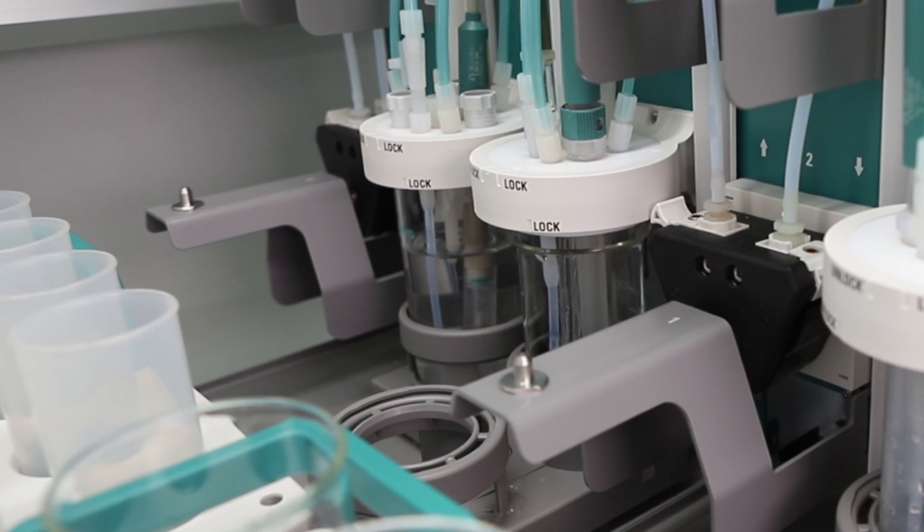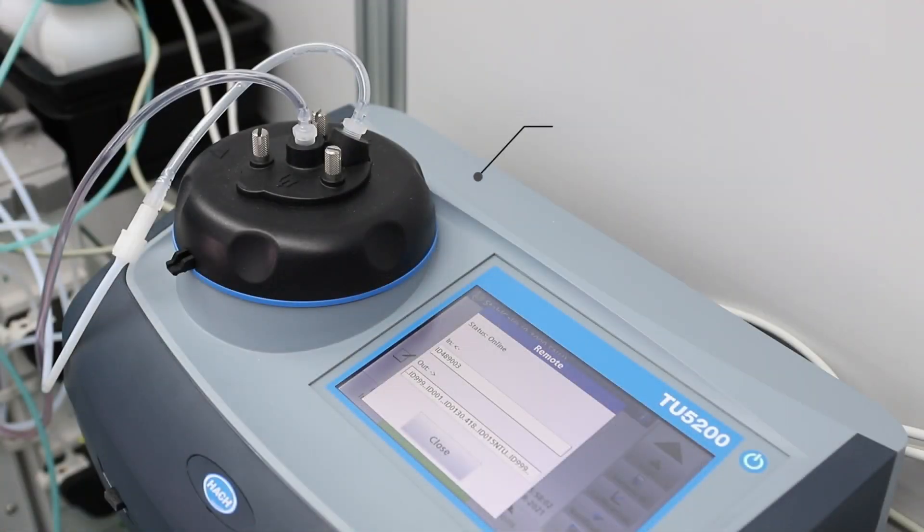The sample is transferred to the flow-through cell of the turbidity meter using the peristaltic pump, and then the turbidity is measured.